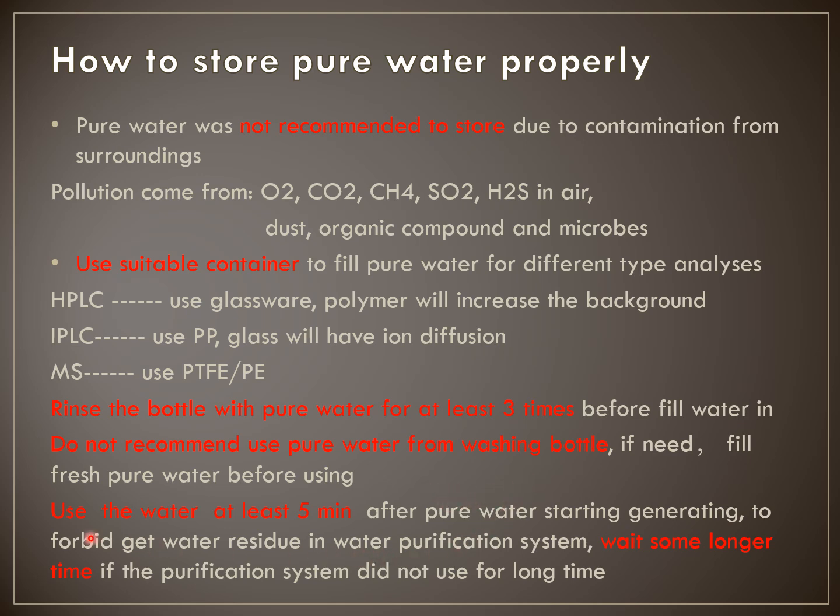At the same time, you need to pay attention when your instrument is not used frequently. We need to wait some time before we start to collect the ultra pure water from our water purification system. If your water purification system generates ultra pure water every day, before you use it we recommend waiting at least 5 minutes after the ultra pure water is ready.